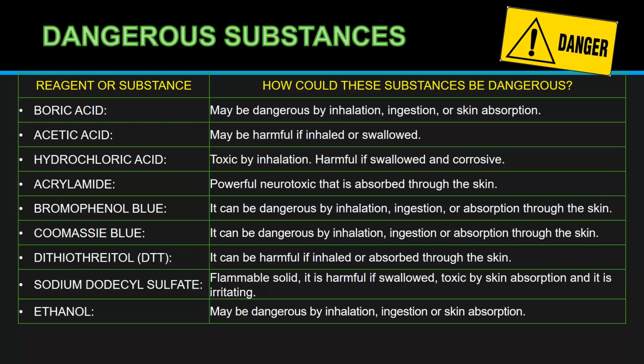Boric acid may be dangerous by inhalation, ingestion, or skin absorption. Acetic acid may be harmful if inhaled or swallowed. Hydrochloric acid, toxic by inhalation, harmful if swallowed and corrosive. Acrylamide, powerful neurotoxic that is absorbed through the skin. Bromophenol blue, it can be dangerous by inhalation, ingestion, or absorption through the skin.